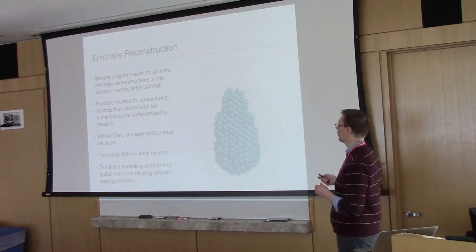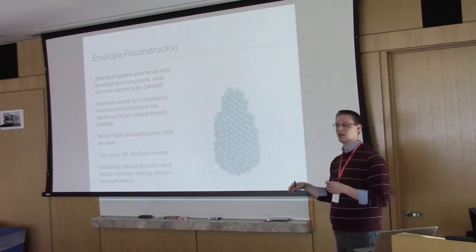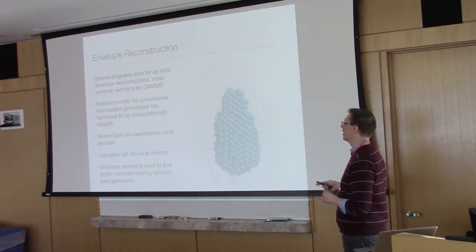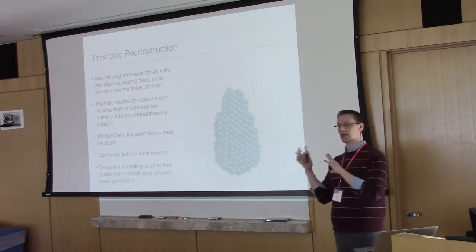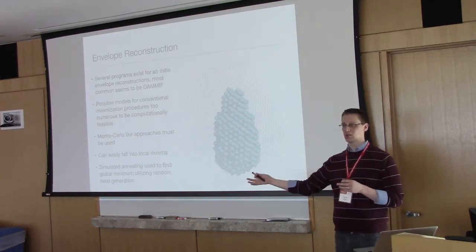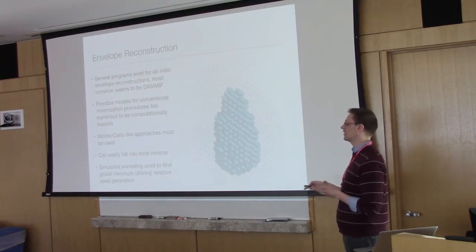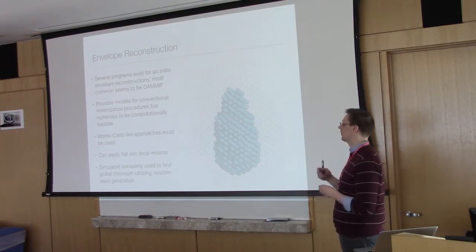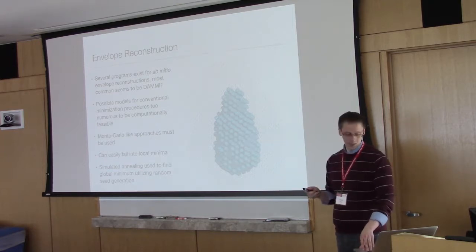The reason for that is because if you only went directly through this sort of gradient search where you're always getting better, you're going to get trapped in local minima all the time. So it uses simulated annealing to try to randomize some of this, to allow for some incorrect, potentially worse versions, that may in the future, when it goes through more iterations, get better. When you're running these programs and you see things like simulated annealing and temperature factors, that's all referring to effectively allowing it to get worse with the hope of getting better in the future. So that's the basic idea.